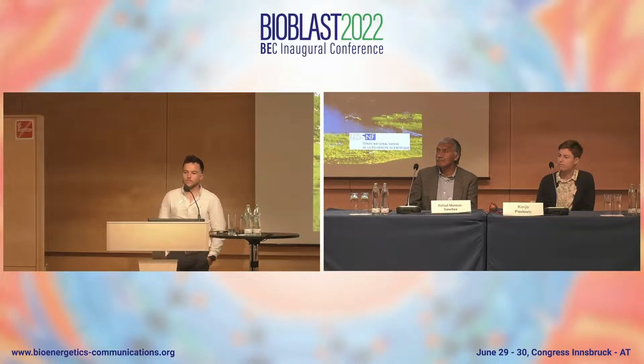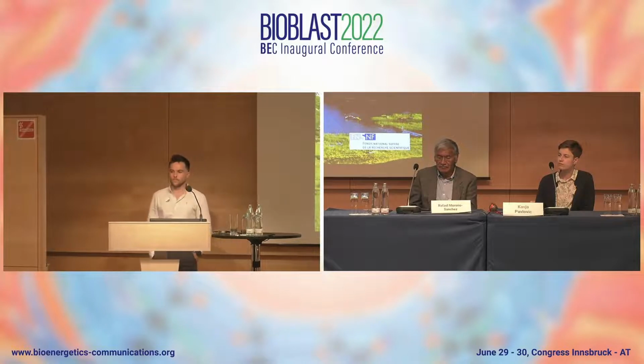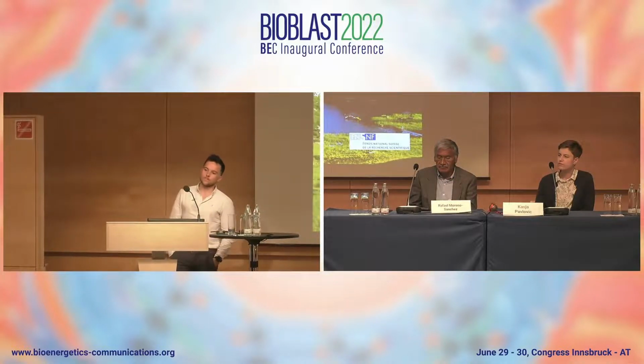Super nice talk, Chris. Well done. I have a question about the respirometry experiments, for instance, in your permeabilized fibers. It was mentioned already that where the critical O2 starts to become limiting for respiration is already higher than ambient O2 levels.